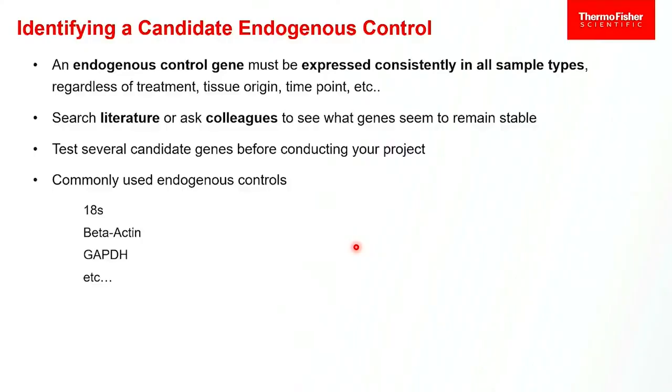How is it treated? If you're doing a time course and you treat your cells, well, you have to test: does this change or not? You can trust other people and pull from publications. That's fine too. I have had it happen enough that what I'm doing is slightly different from what previous researchers were doing. My process is slightly different, and I have trouble trusting implicitly what's in papers, personally. You're an experimenter. You get to choose those.